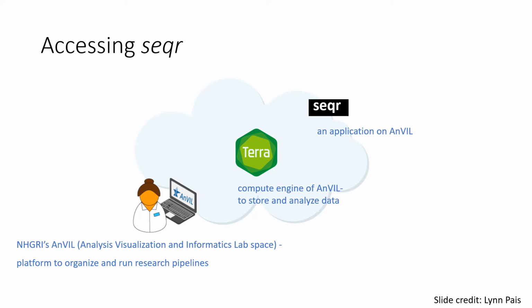And if after participating in this session you think that seqr might be useful for your own work, I do want to remind you again that seqr is now available on AnVIL. So any AnVIL user can bring your own joint called VCF or create one using Terra-supported workflows, and then load that data to your own private seqr project for analysis.